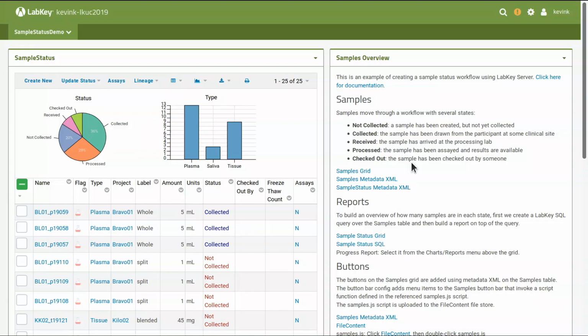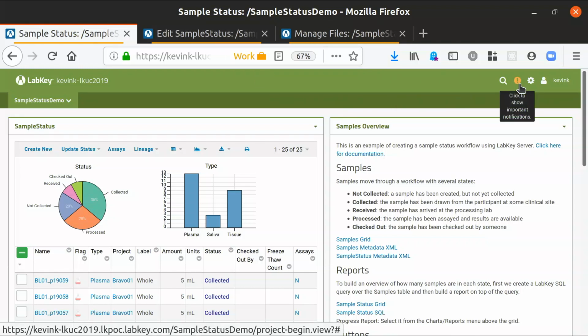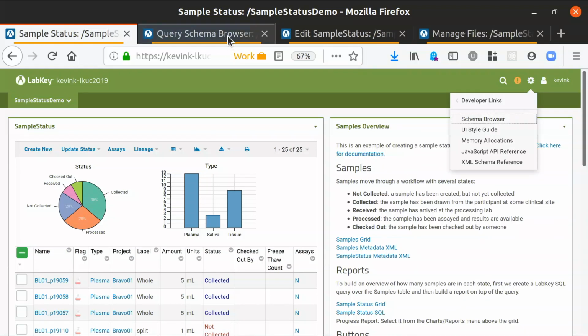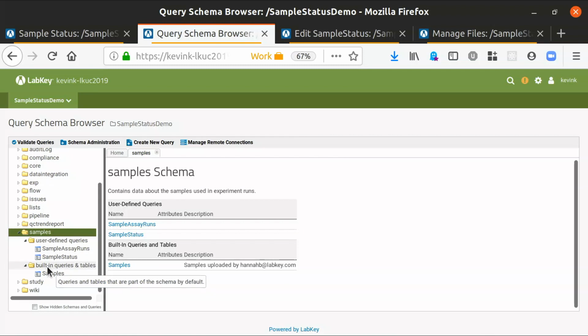If in your previous grid view you select the first children or parents, right? In the grid, you can add a column that shows the parent or children, yes. When you select all, it will separate them with commas. Yeah, I can quickly show that. So the question is, can we see more than the first level of sample lineage within the grid? Right, how does it show it, and how does it represent that?